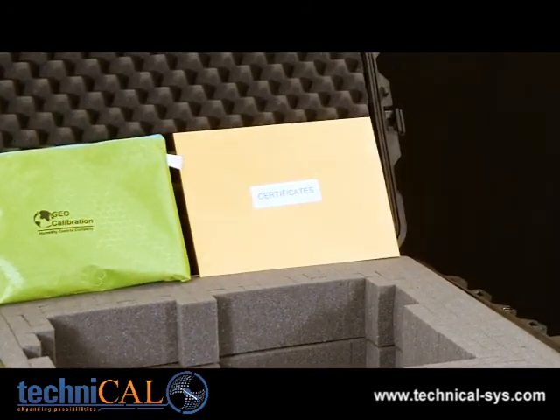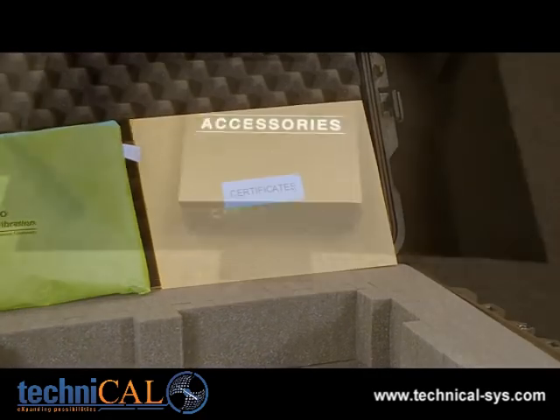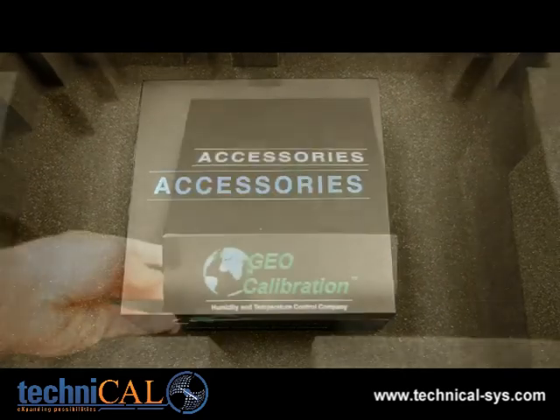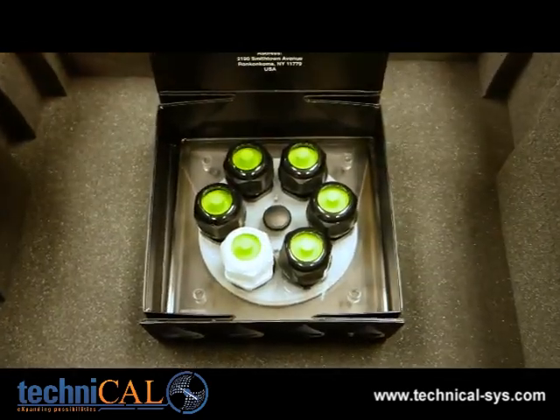Finally, you should also have a manila envelope that contains your factory calibration report. At the very bottom of the case, you'll find an accessories box. Inside, there will be a six port door filled with six green plugs.